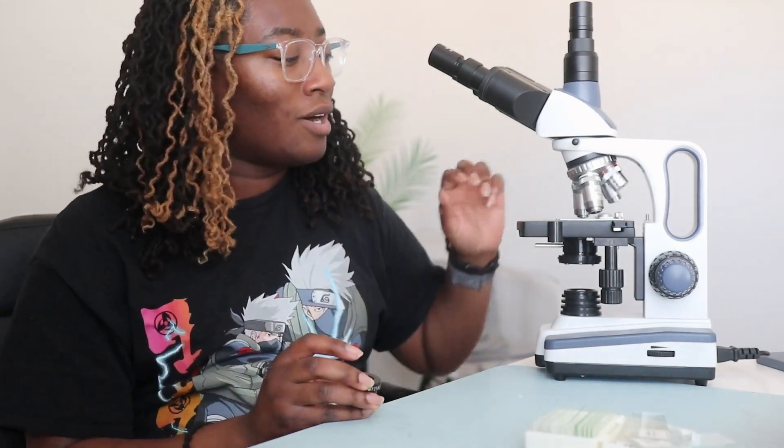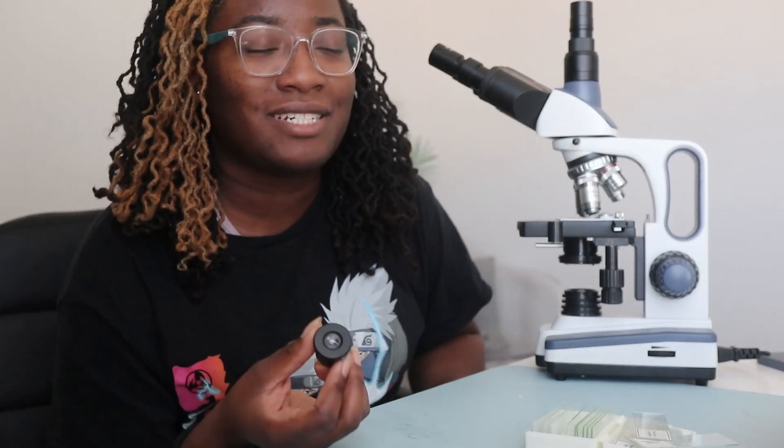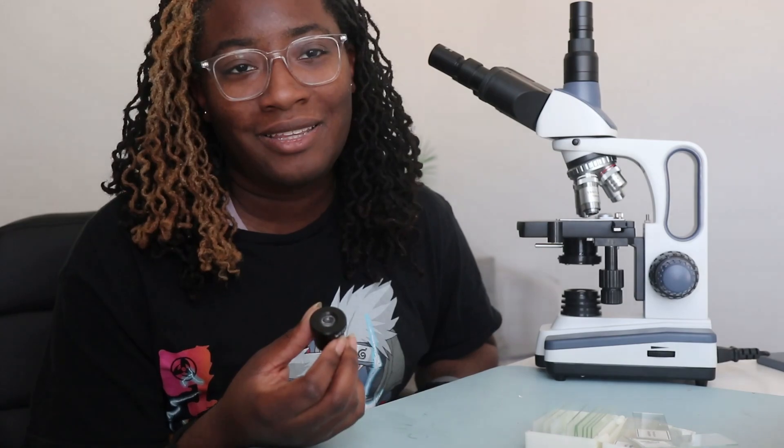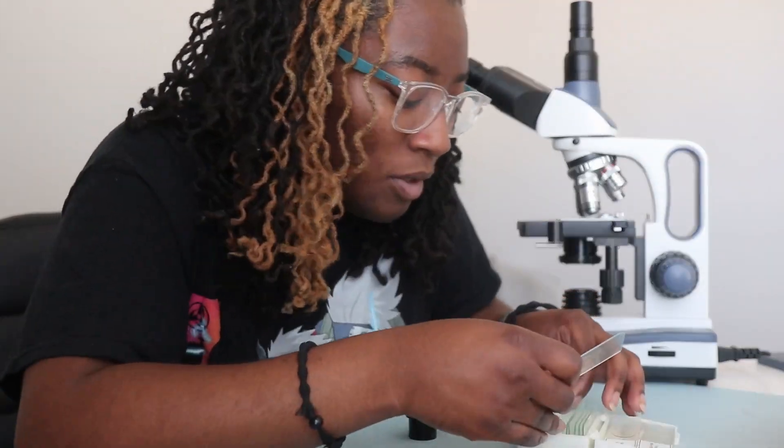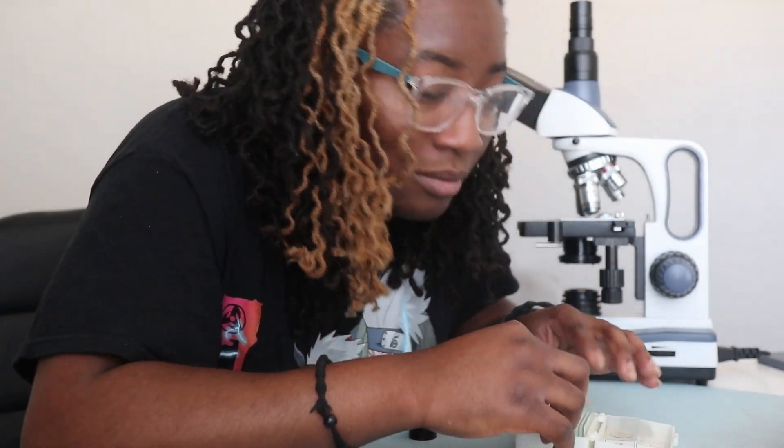Now let's talk about some specifications. When discussing objective lenses and magnification, this scope can go up to 2500x — you multiply your highest objective lens number with your highest ocular lens: 25x with 100x puts us at 2500x magnification. I do not think you need that much magnification for most microscopic things. The max you would typically need to use is 1000x. I think most scopes, you really just need the 10x ocular and the 100x objective to get a clear picture of something.